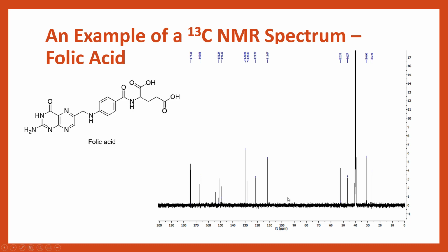But there's obviously a trade-off here, because the more we amplify, the more we zone in on the spectrum, we also increase the noise. So we can see our baseline here is really, really noisy, and this is possible with carbon NMR. So it's, again, just something to be aware of. We typically will have a noisier baseline when we're dealing with samples that maybe aren't fully soluble, maybe it's a little bit too dilute, or maybe we just think we're missing some peaks, so we've zoomed in a little bit.